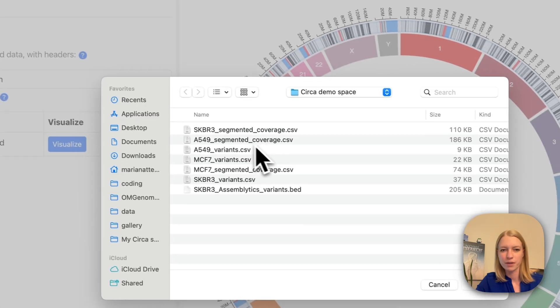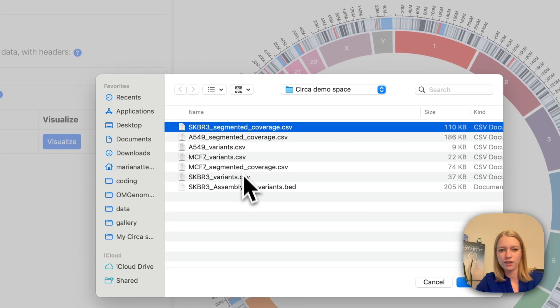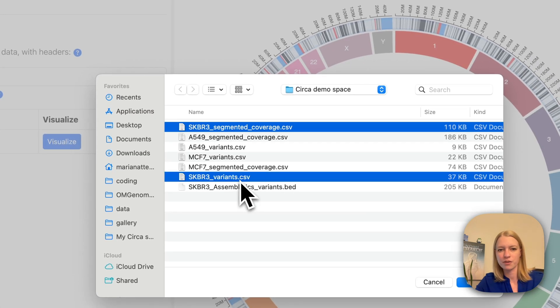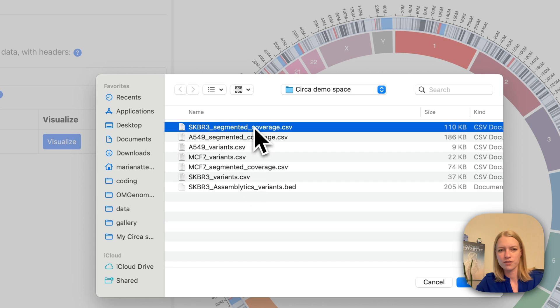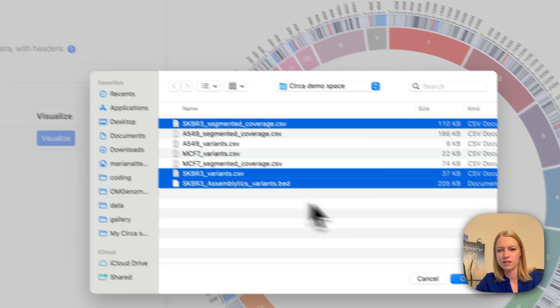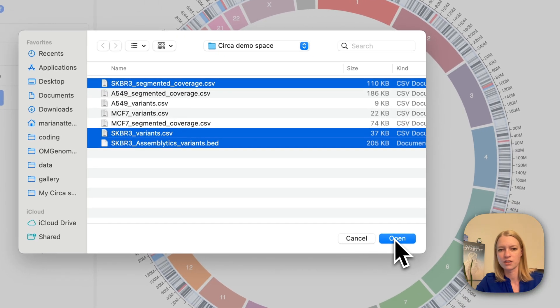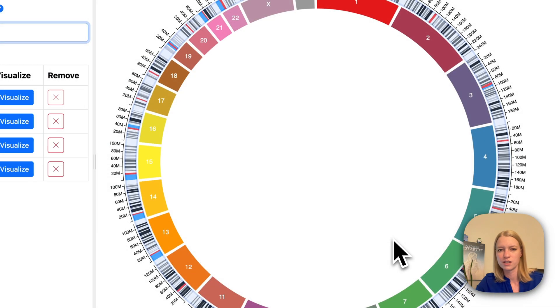We're going to pick three files that I have, a coverage file, a variance file, and another variance file.